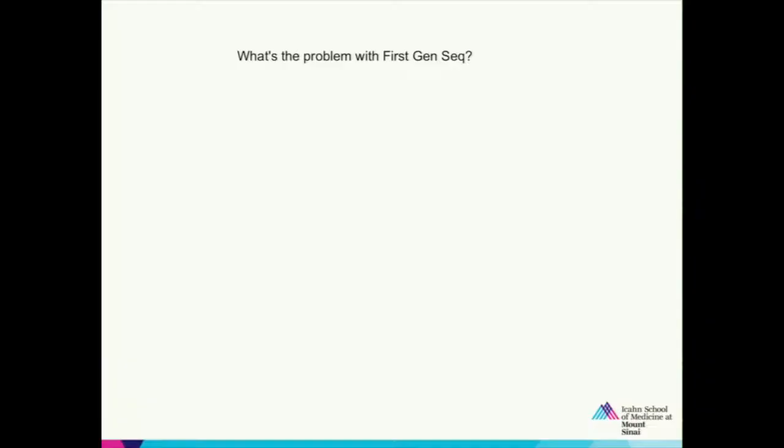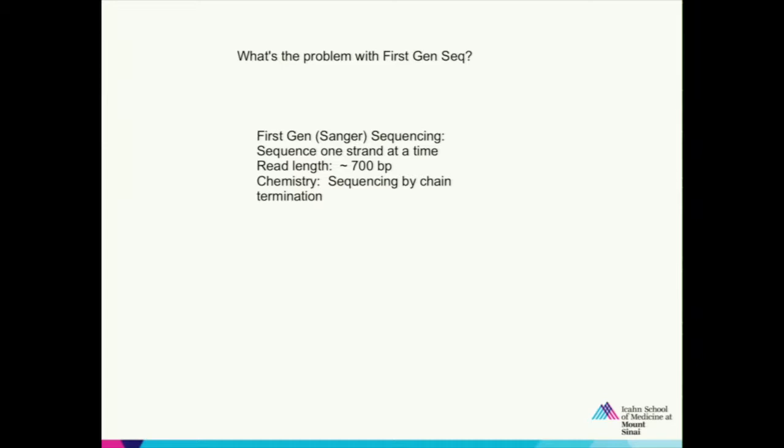So what I'm saying is first-generation sequencing, and then second-generation sequencing. This is first-generation sequencing, Sanger sequencing, because he first showed how to sequence the DNA. That was a great concept. And then we went through this slide. I'm reproducing this slide here again just to emphasize the greatness of Sanger sequencing. You can sequence one at a time, and 700 base pairs.